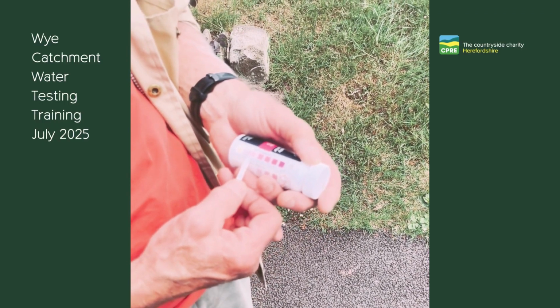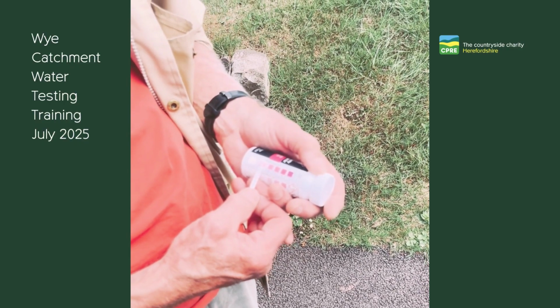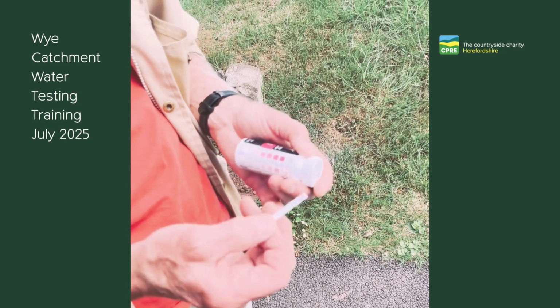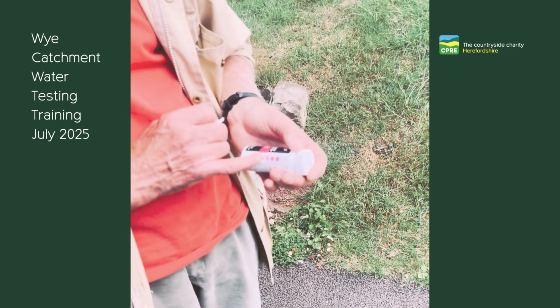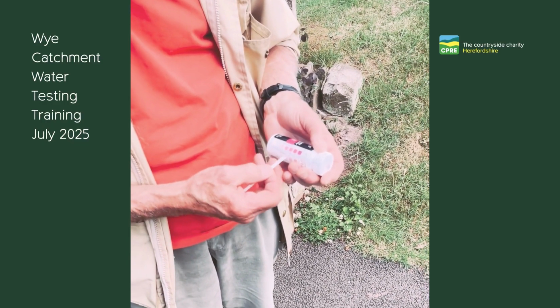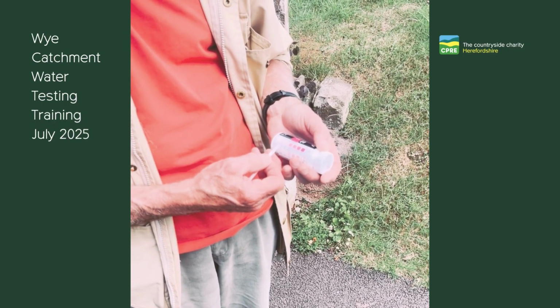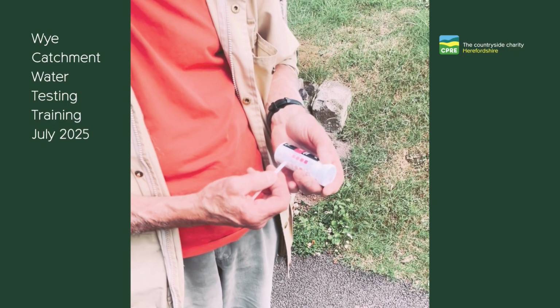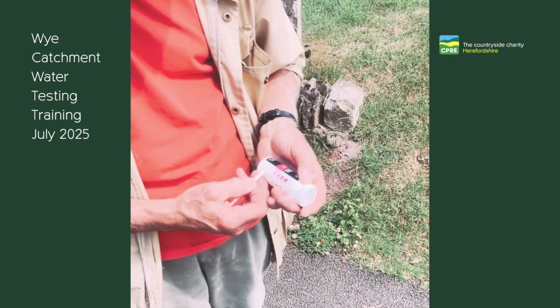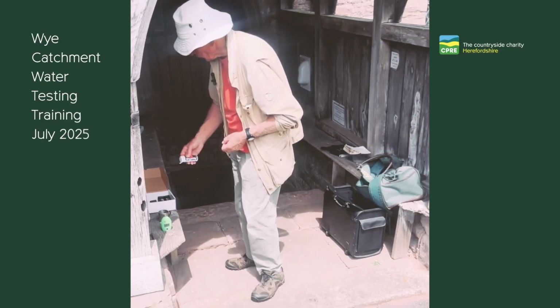This is quite unusual, but it's because we're using tap water. One would expect normally on a stream the nitrate reading of between 5 and 10, in which case this color would be closer to the colors on the tube here for 5 and 10. It's not possible to enter an intermediate value, so you have to decide which of these it's closest to, and in this case it's clearly 2. Okay, so that's all there is to it when it comes to nitrate testing.